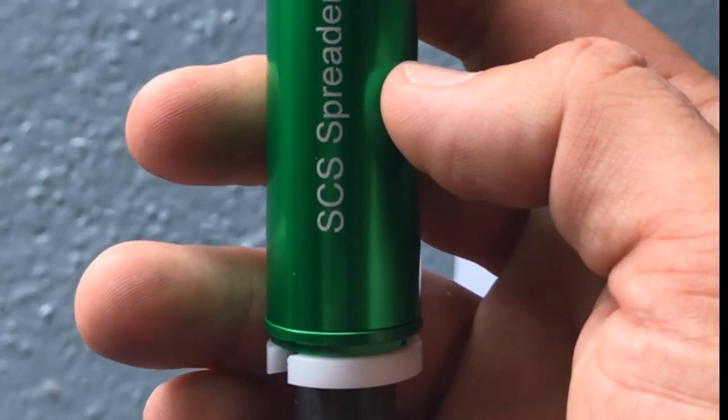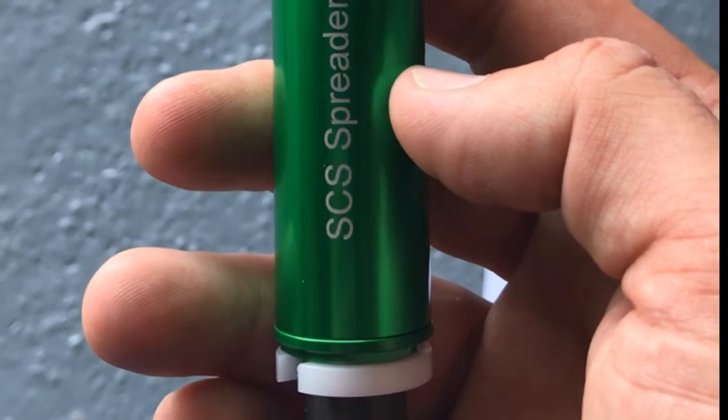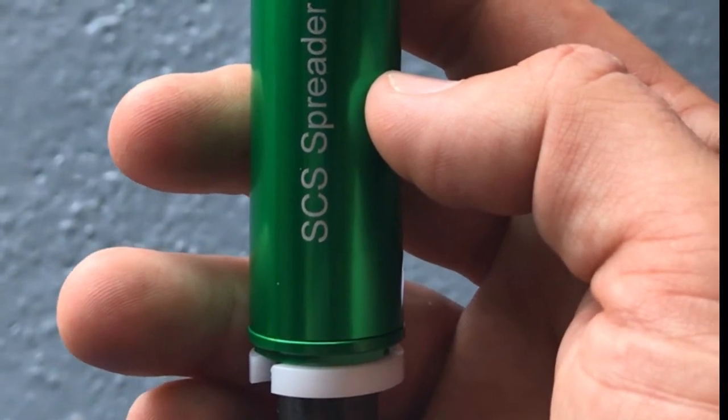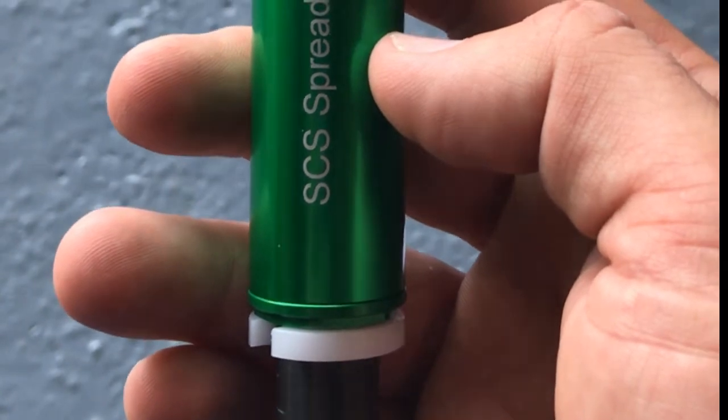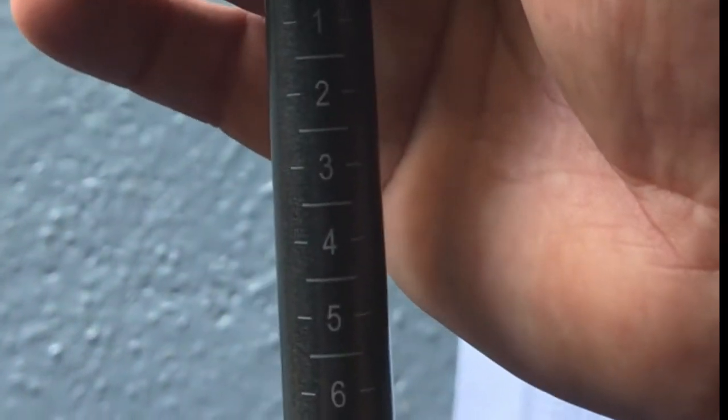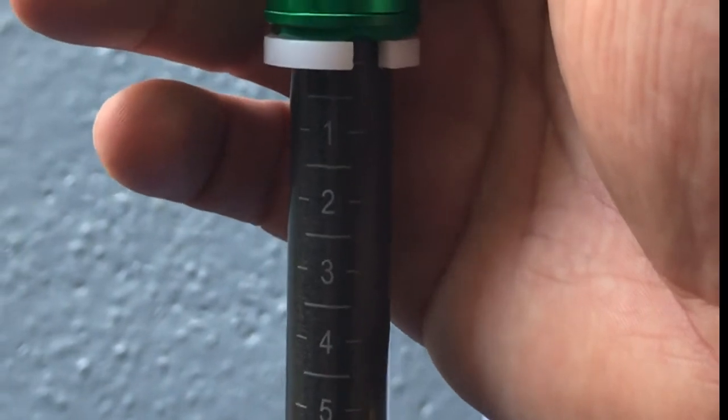Just a little video on strength of fertilizer. This is a strength tester from SCS — pretty simple. All you do is press down on the granule, and at the point it shatters you can read the scale, and that tells you the strength of the fertilizer.